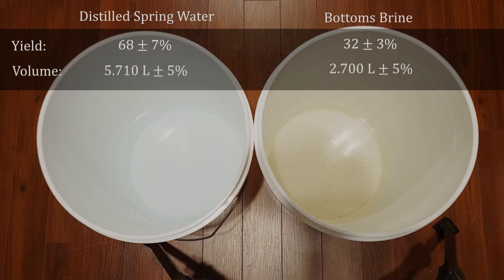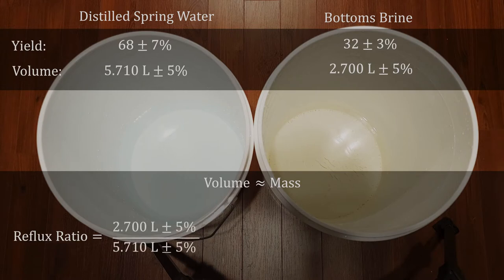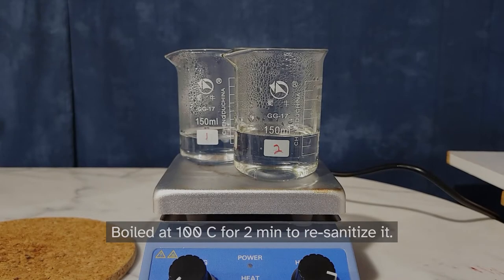Note that in chemical engineering, these measurements are often captured by a single number called a reflux ratio, which characterizes the performance of your distillation column. This is calculated by dividing the bottom's mass by the distillate mass. In this case, I operated the distillation process with a reflux ratio of 47% ± 5%. But before I end all this off, of course, I need to try drinking it.